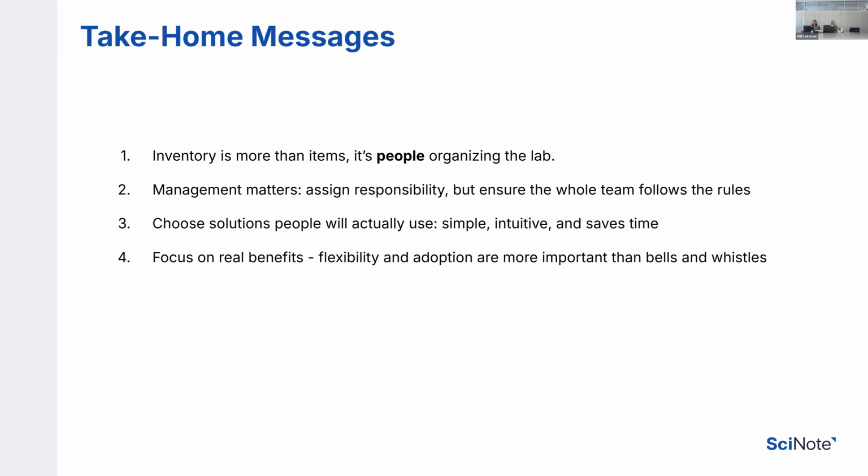So it's very important that you get the whole team involved. We are offering trainings. We are offering that support system for you. So make sure you get confident with whichever new system you decide to go with. Second thing is management matters. So assign a responsibility, but ensure the whole team follows the rules.